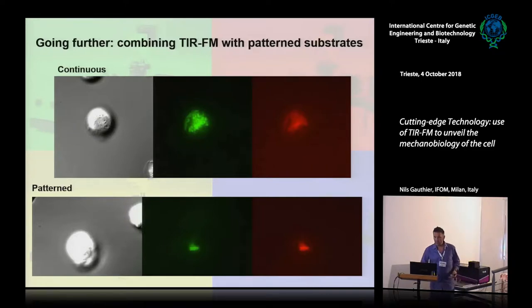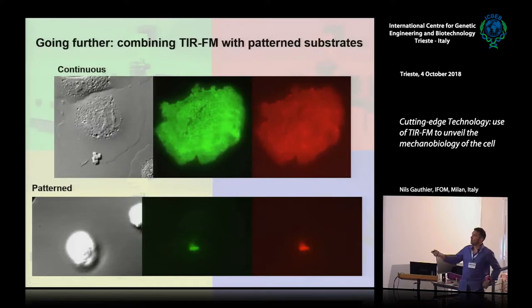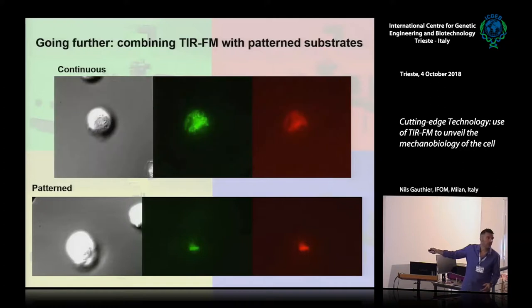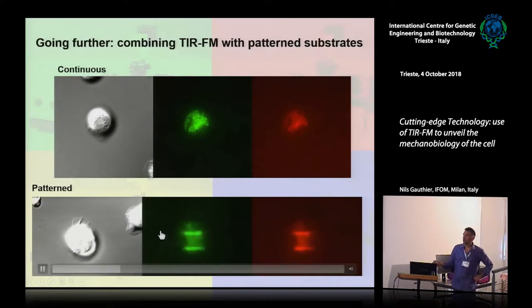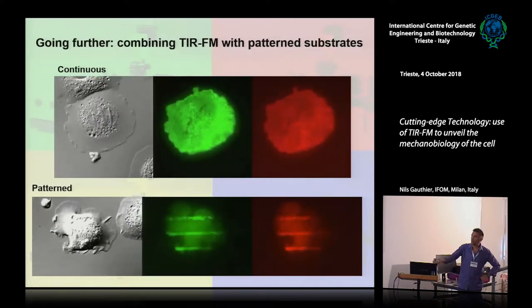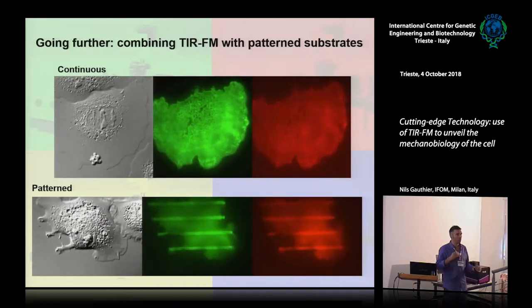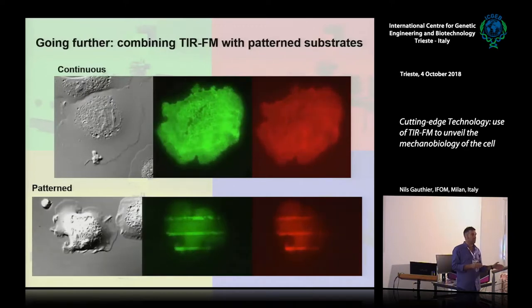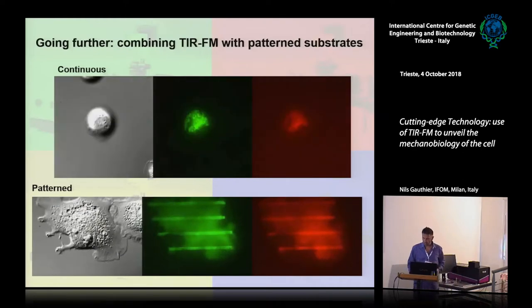And you're going to see that the major difference is that here I can identify the markers of adhesion, because later on you see they start to mature, then my contrast is a bit higher, and I know where they are. But this is much easier here, because my contrast is so high that I can identify exactly where it adheres, because the lines are the only adhesive zones. And then immediately you understand much better what is adherent and what is not adherent, and you can have a clear answer on the process, okay?